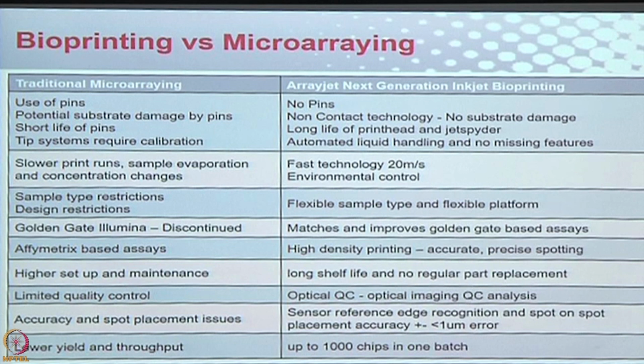It'll go back and print it. So at the end of the run, you've not wasted your antibody. You're able to get a full set of data from that one printing, because it remembered that if it missed somewhere, because maybe you missed putting the sample, or it was a bit sticky and it couldn't get aspirated. In many of these techniques, the software, which is called the iris as the eye, can recognize which, okay, slide number 1000 has my antibody 5 missing.